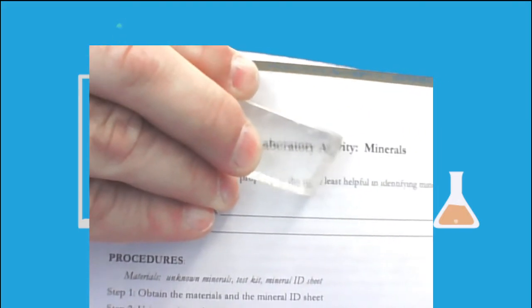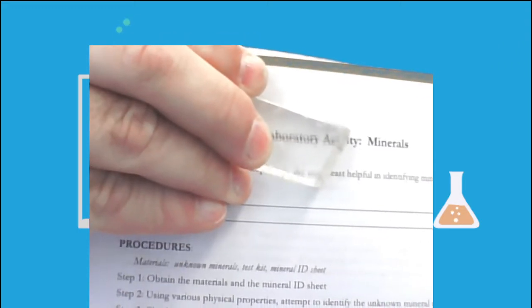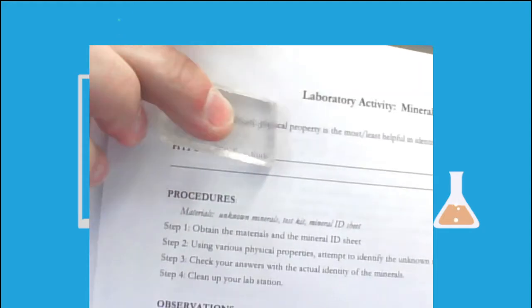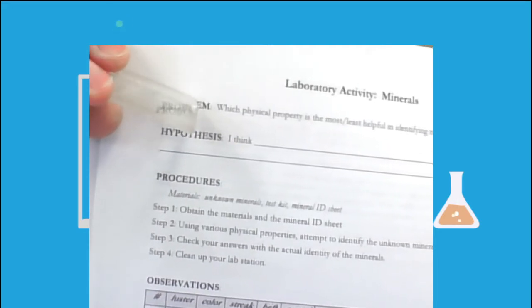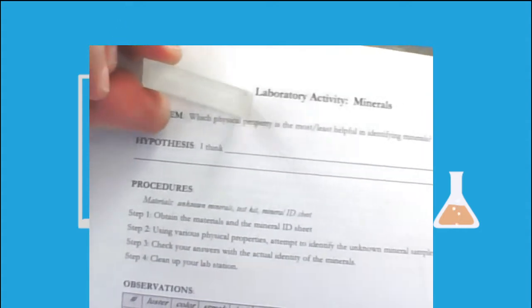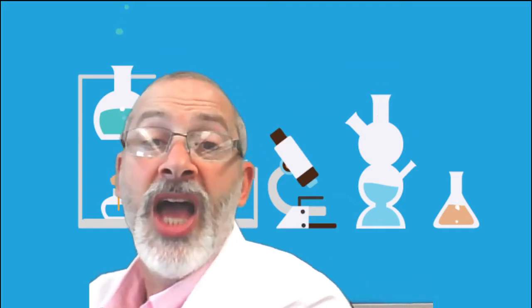you look through it. It's almost like you've got double vision, because this mineral has an interesting optical property that changes the refraction of light as it goes through. See how it looks like you've got double vision here? That's an interesting optical property of mineral number 9. And that brings us to the last one, mineral number 10.